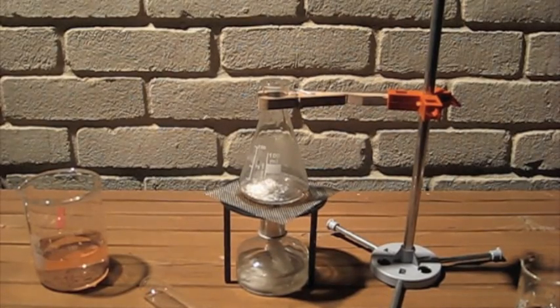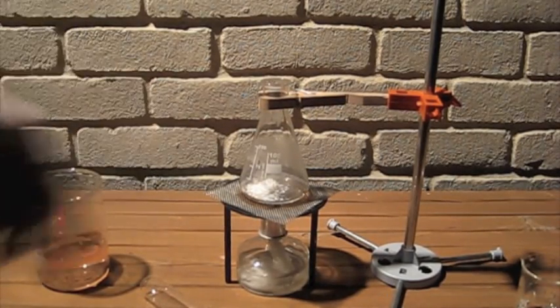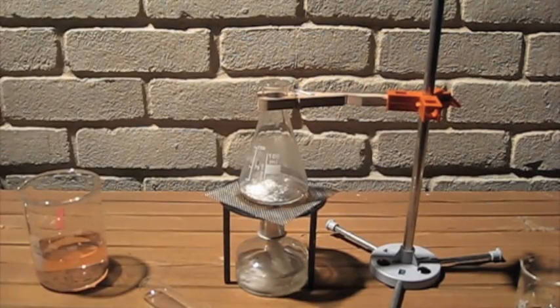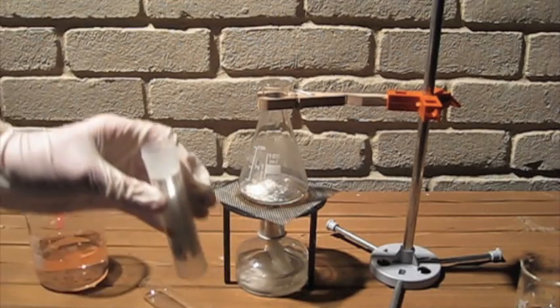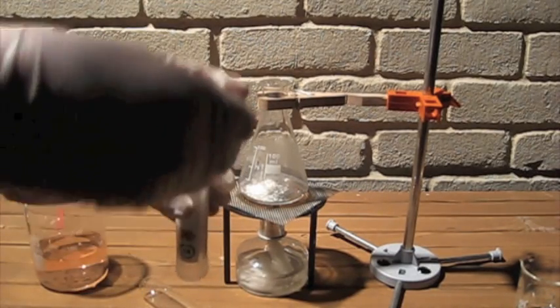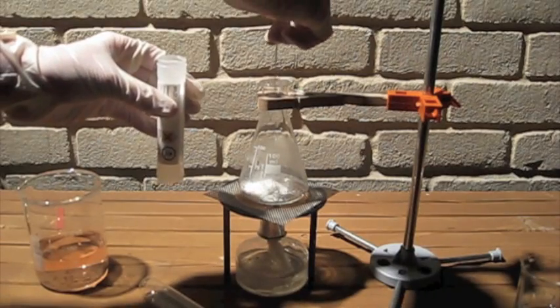In this flask I have a small amount of calcium hydroxide. To that I'm going to add an even amount of ammonium chloride. This will produce water, ammonia gas, and calcium chloride.